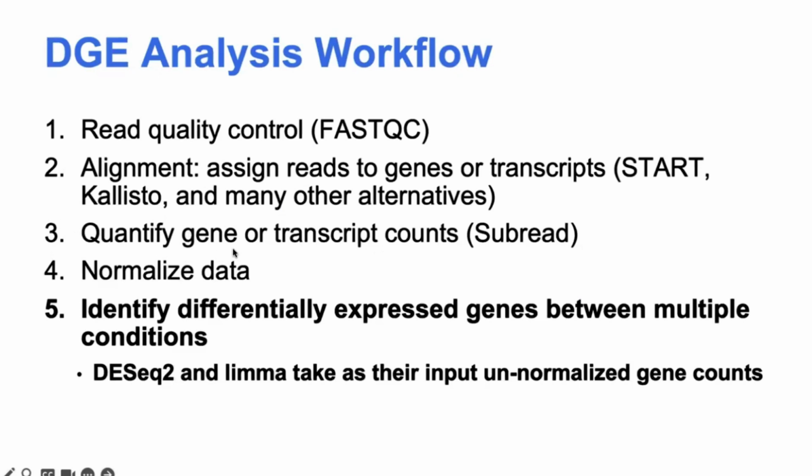But there are other popular packages that might expect a specific kind of normalization, such as RPKM or TPM. That's something to be aware of: depending on the method you're using, different normalization methods will be appropriate.